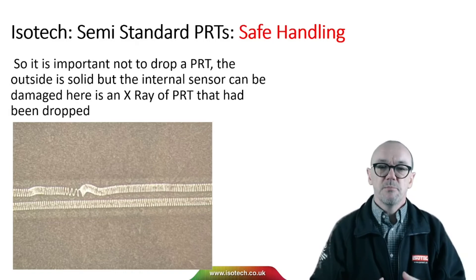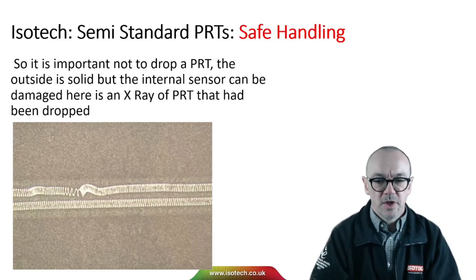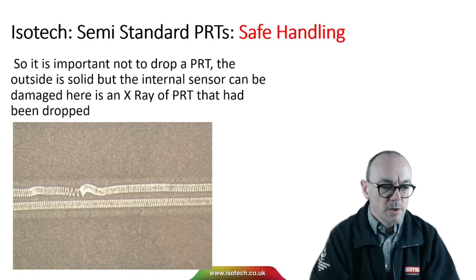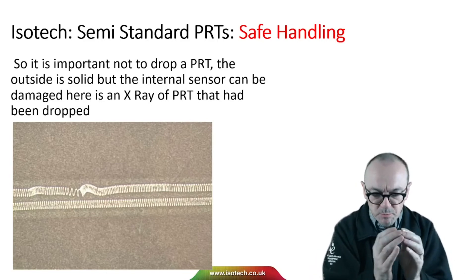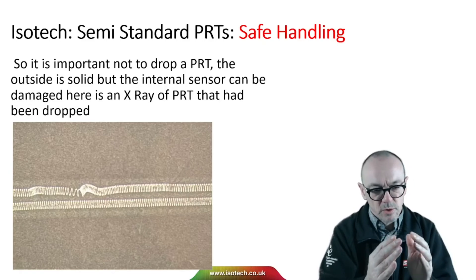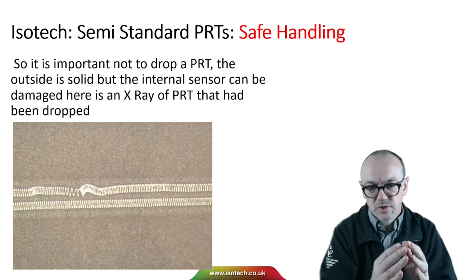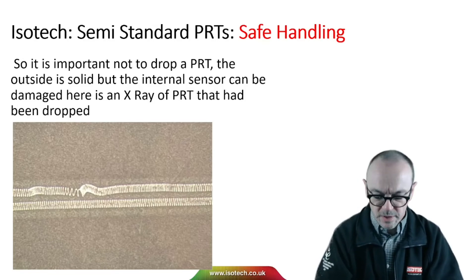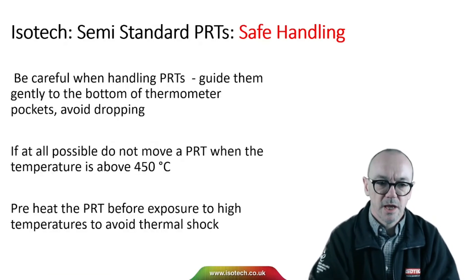It's very important not to drop a PRT. The outside is solid and rugged, but the internal sensor can be damaged. In the picture here, we have an X-ray of a PRT that had been dropped, and you can see the turns of platinum have been bunched together and distorted. Shorted turns will destroy the thermometer — the resistance will change lower intermittently. So it's very important to handle PRTs carefully.